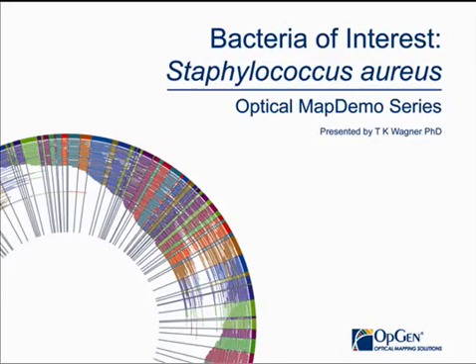We would like to welcome you to this module entitled Optical Mapping Bacteria of Interest. In this module, we will show you how optical mapping can be a powerful technology for the analysis of Staphylococcus aureus. Optical mapping is a powerful technology to analyze whole genomes of microorganisms quickly and effectively. Without the need of DNA sequence information, optical mapping can be used for comparative genomics, strain typing, and whole genome sequence assembly. Optical mapping does this by using an extremely novel technology that visualizes pieces of genomic DNA.